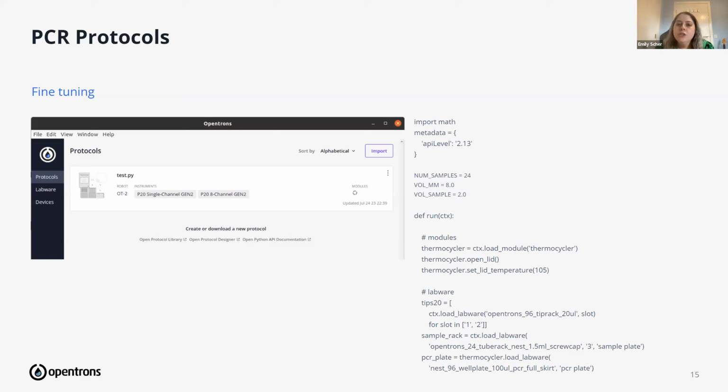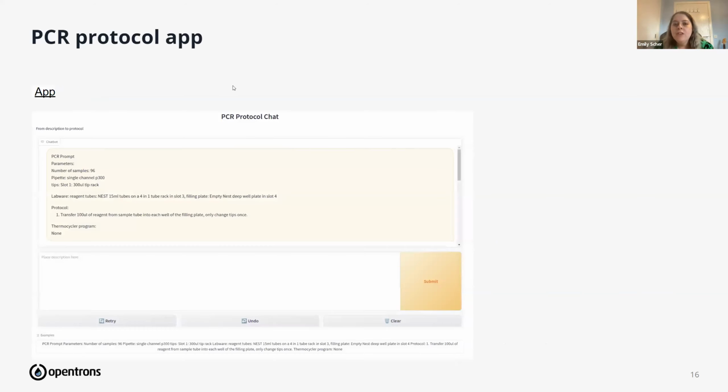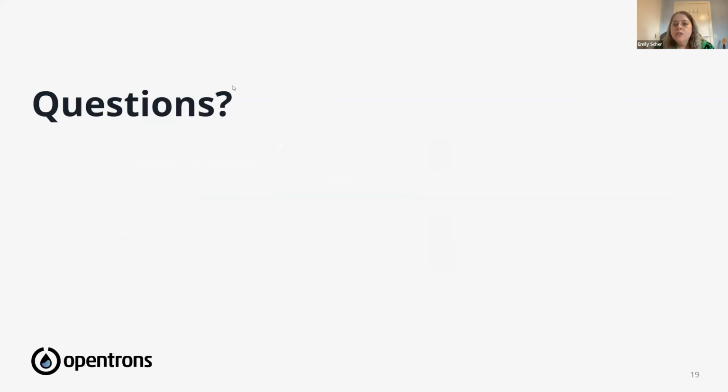Yeah, so we've looked into using Llama in particular because, even if we had hundreds of data points, that sounds like quite a lot, but actually in the machine learning world, that's still very small. So one of the things that we can use to boost those numbers is unsupervised learning, which is basically when you just provide a prompt or just provide a protocol, but you don't provide them paired. Because we can come up with just one end of those things much faster than we can come up with those together. That's something that we've looked into, and that's something that you can do in Llama.